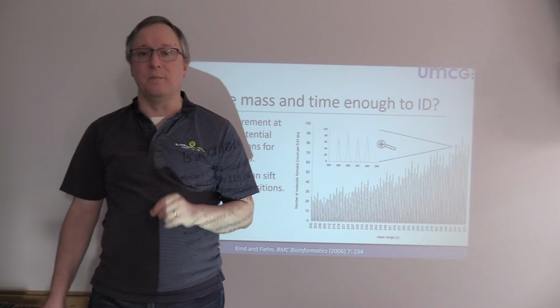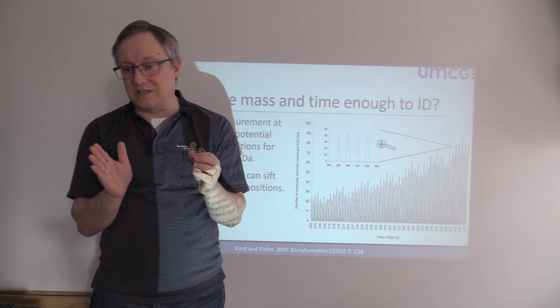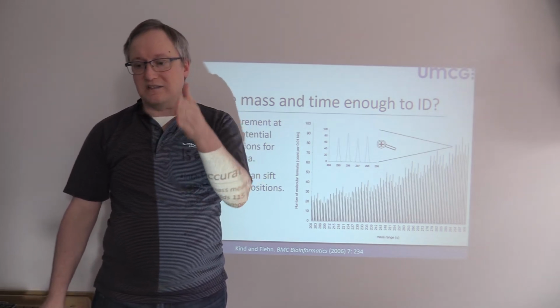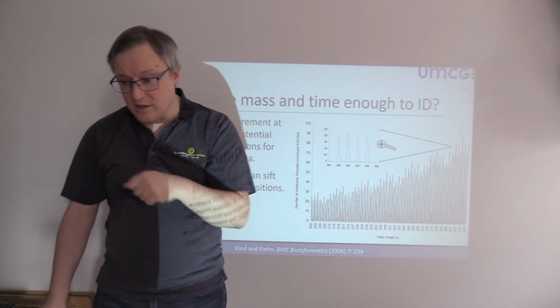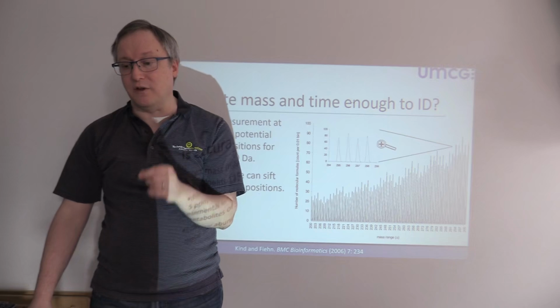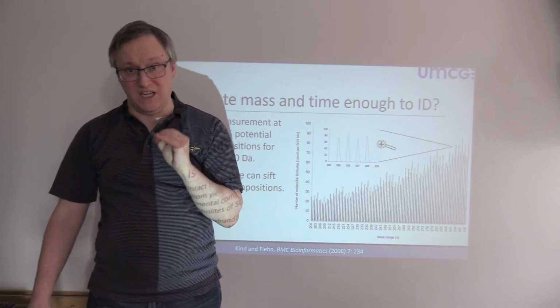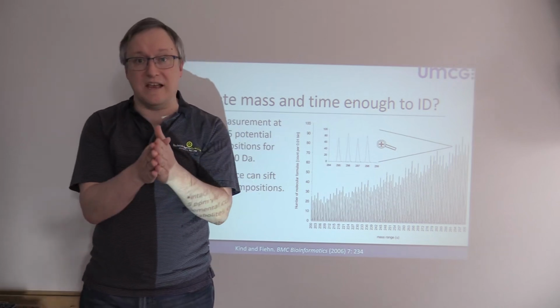So let's then ask, can we get the composition from this? So in this case, in our highly mass accurate GCMS experiment, we've now said this ion has a mass of 500 Daltons plus or minus 5 ppm. This paper from Tobias Kind and Oliver Fiehn put together some simulations of this problem, and what they found was that this scenario means that we have 115 different chemical compositions that correspond to this mass.